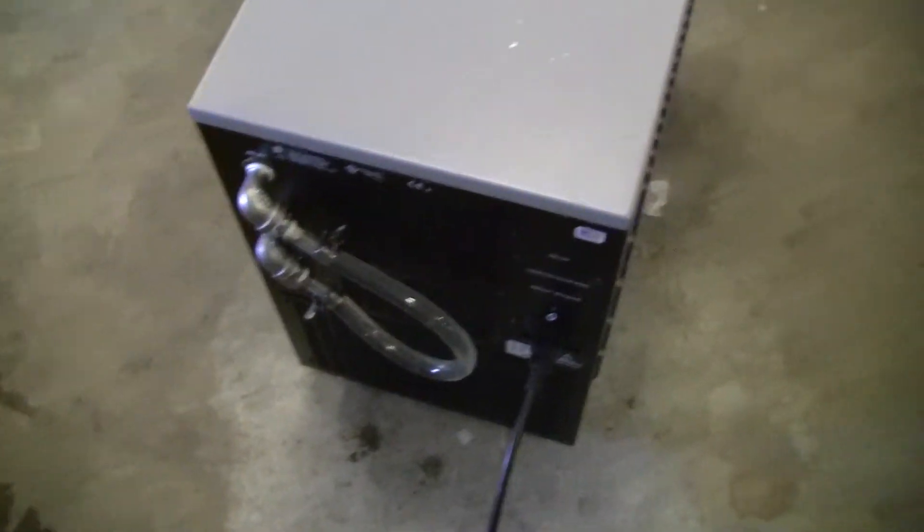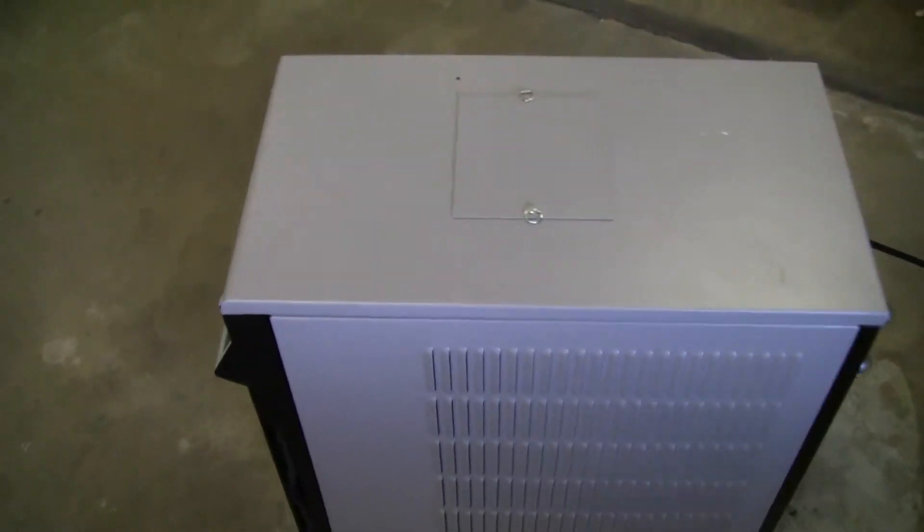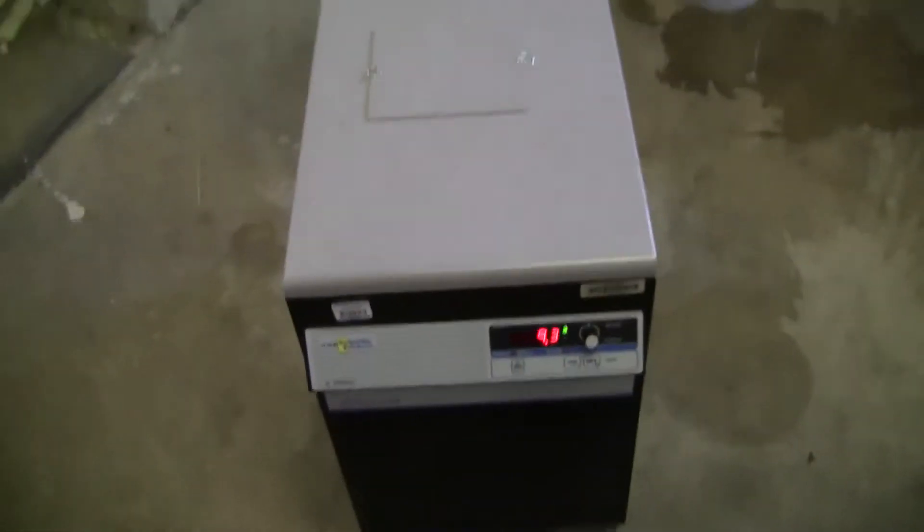It's nice and clean. There's a little scratch right there. There's our recirculating loop in the back. Only one slight cosmetic scratch.